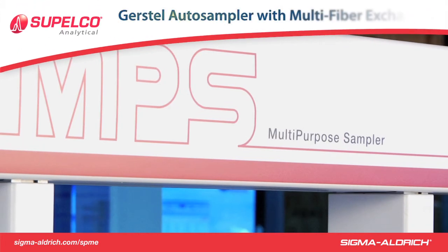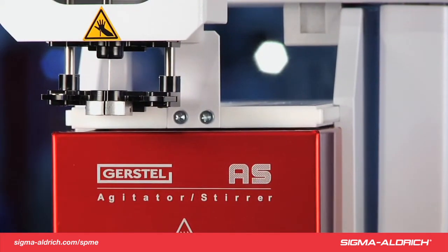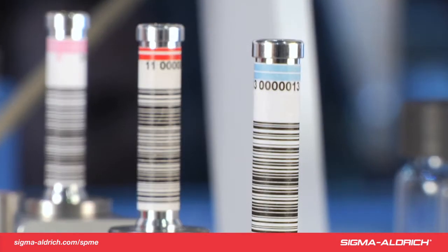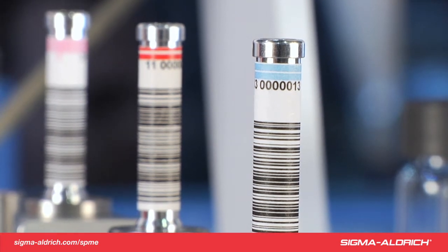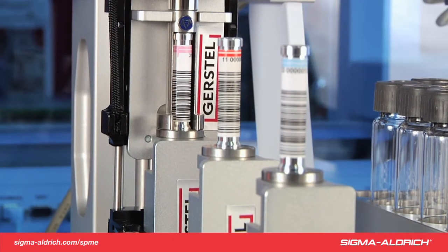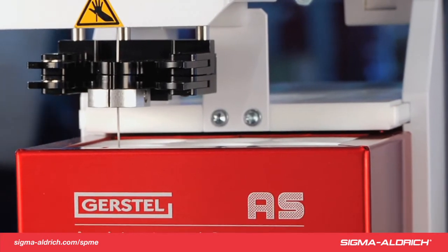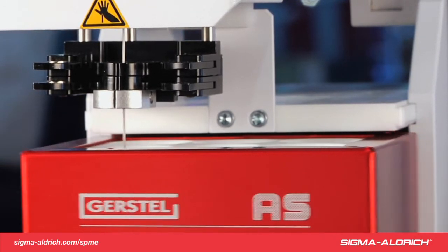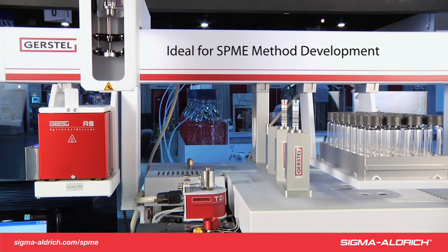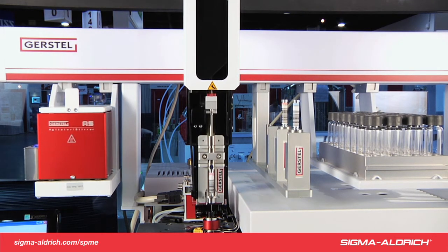The Gerstl MPS multi-purpose sampler, shown here, uses a three-position multi-fiber exchanger. The multi-fiber exchanger, or MFX, allows automated exchange of SPME fibers on the auto-sampler for easier and quicker SPME method development and automated desorption. The fast and easy interchangeability of the Fast Fit fiber assemblies means there is no manual switching required when performing extractions with different SPME phase and fiber coatings. Setting up different phase chemistries permits automated screening for optimal selectivity, which is ideal for SPME method development, making it easy to evaluate different polarity ranges for enhancements of analyte extraction.